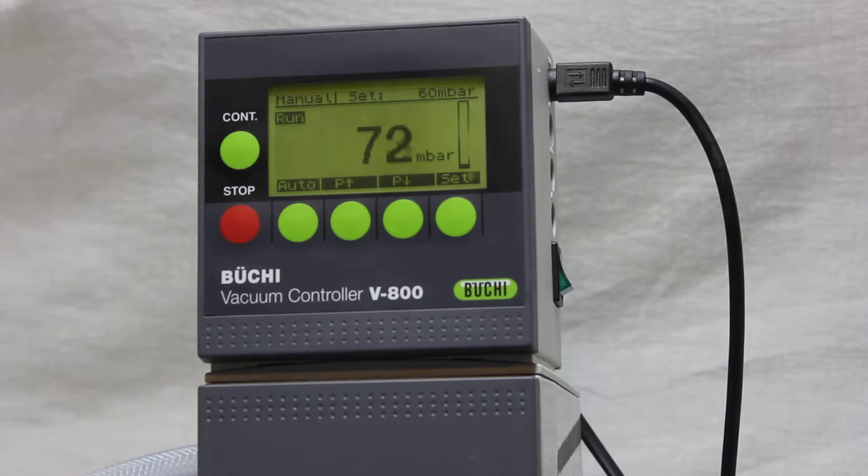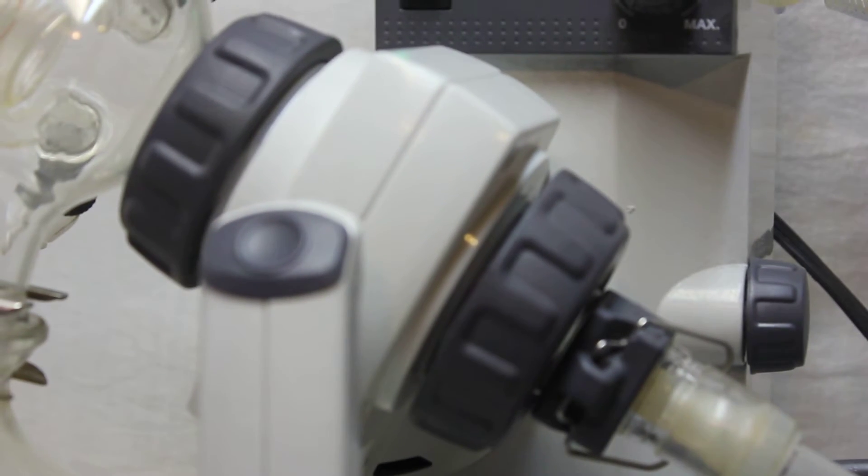I'm going to increase the pressure inside, and then automatically the pump starts working and brings the vacuum down to the set amount which was already configured. You can see it stopped — that shows the system is functioning correctly.